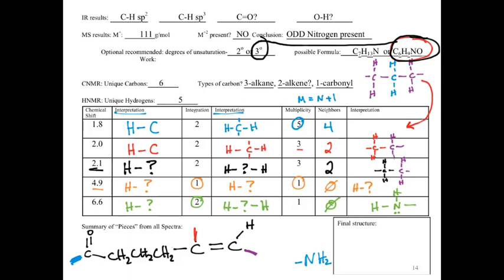Well, let's count out the carbons in each of those. So if we went with blue to red, we would have 1, 2, 3, 4, 5 carbons. I guess I could have counted that out a little bit better. 4, 5 carbons. If we went blue to purple, we would have had 1, 2, 3, 4, 5, 6 carbons in our ring. Well, deciding between those 2 is a bit challenging. What we would hope or aim for is to go for our lowest energy. Or the other option is just draw it and see which one works better or matches the spectra better.